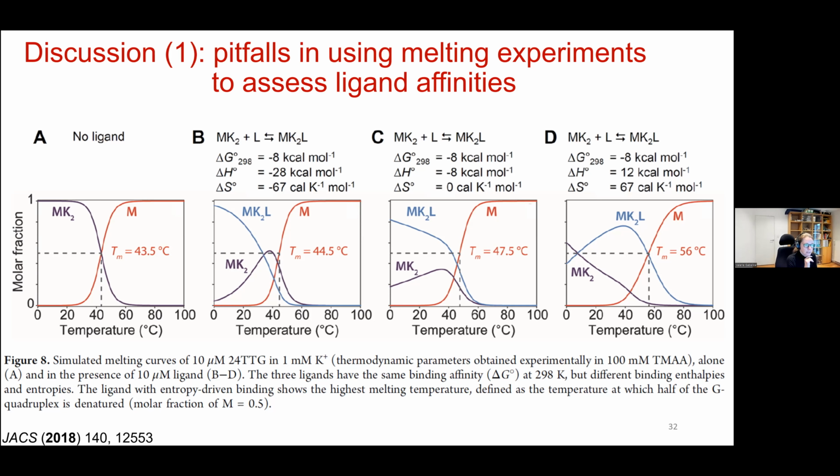So it's just a proposal here, but maybe we should also revisit some of the screenings and really also focus on, let's say, direct assays, also to have a chance to find ligands that are binding in an enthalpically favored manner.